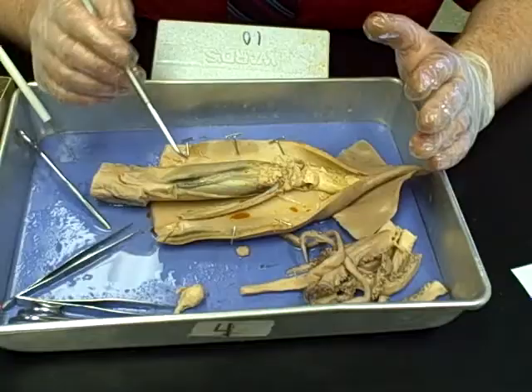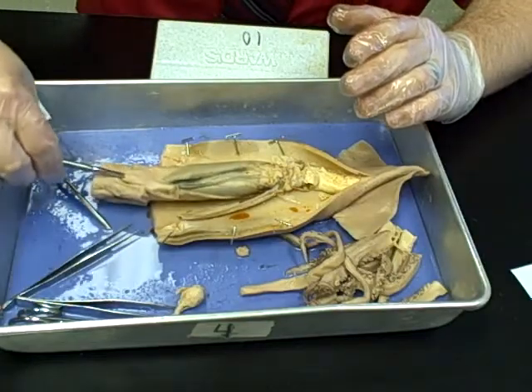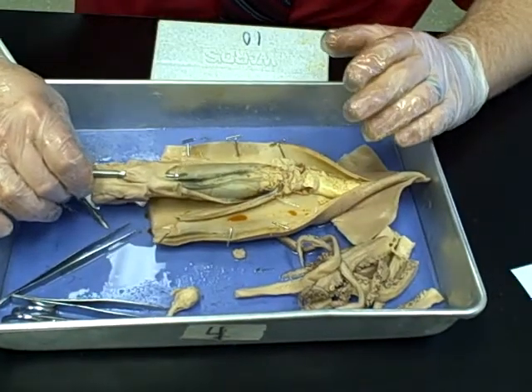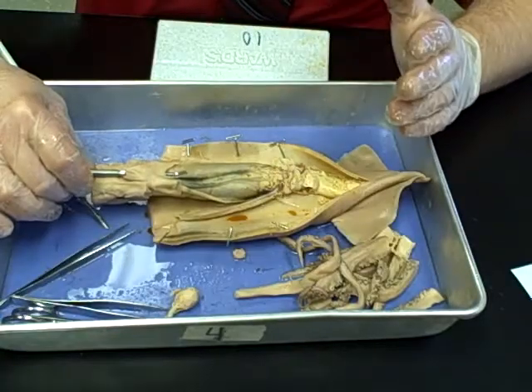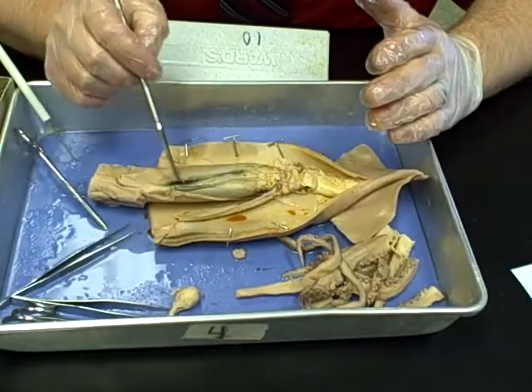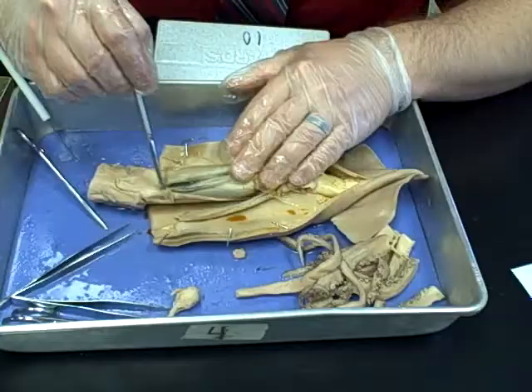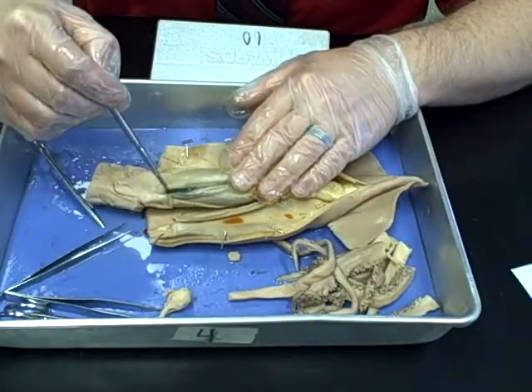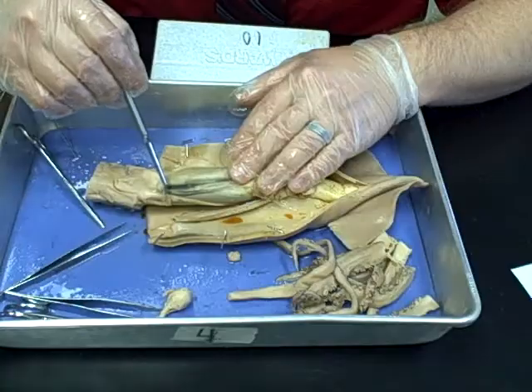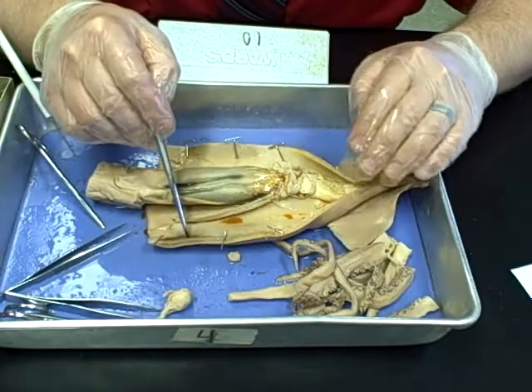To identify some internal structures: the first thing to look at is the siphon. It extends down underneath to inside the squid — this is where the squid expels waste from its digestive system, and also where the squid ejects ink. You can see the ink sac here, which extends down near the tip of the siphon. There's a small opening at the end of the ink sac where ink is ejected down into the siphon. The ink sac has also stained part of the mantle dark and black.